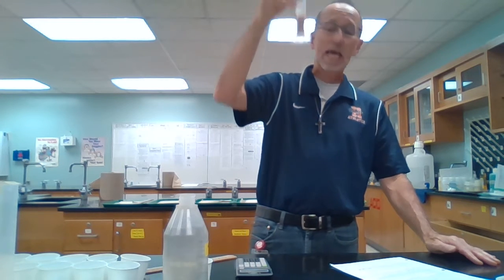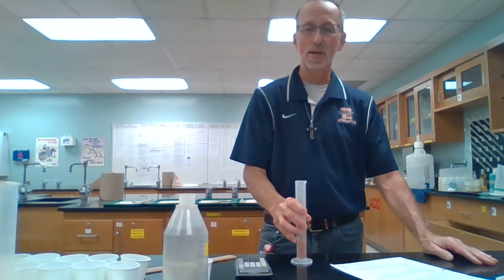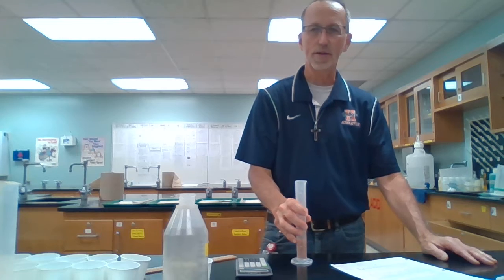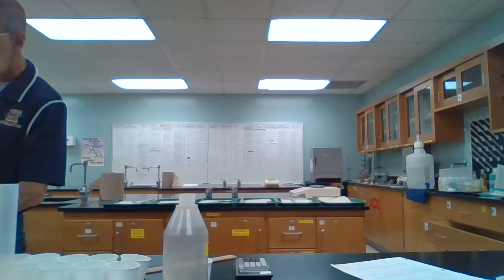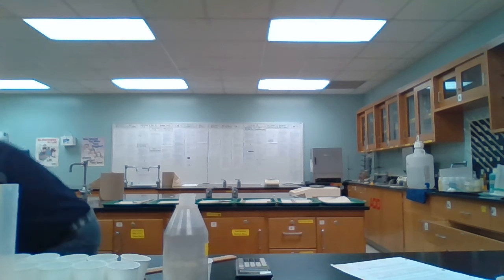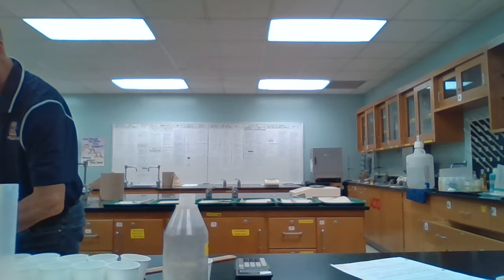Minus 10, 8.2. All right, 8.2 mLs for copper number 6 for volume. Okay, so that takes care of the coppers. Put those over here. I'll be back with you in a second, dealing with all these little pieces here.